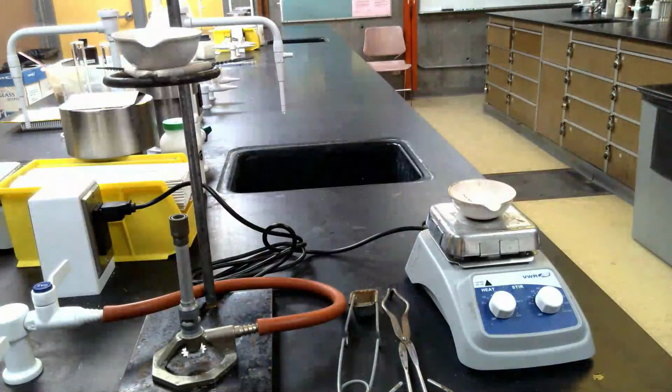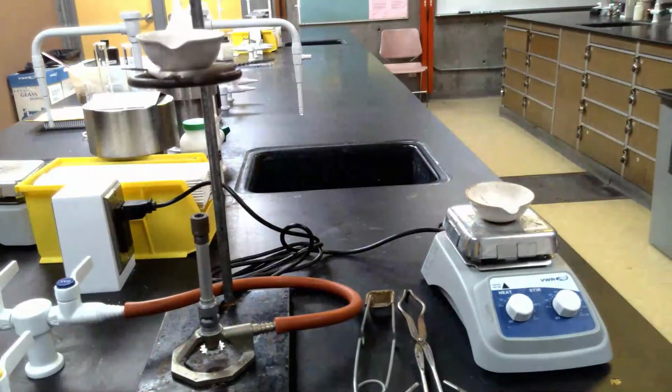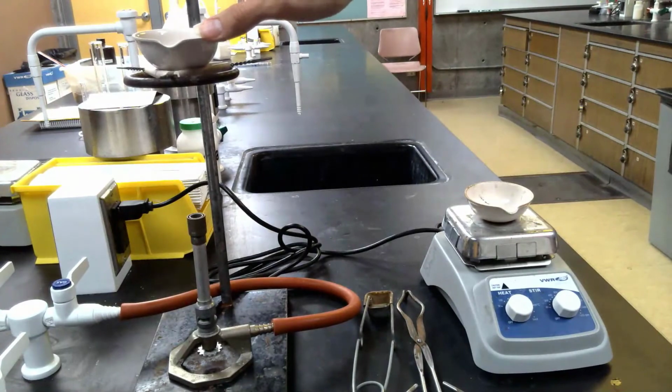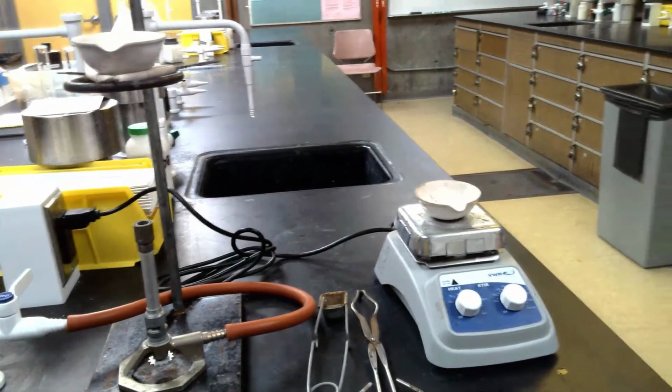I have everything set up here so that I can run both of the heatings to finish the experiment simultaneously, instead of doing everything one at a time. It just saves time that way. I have my salt water in an evaporating dish that I'm going to be heating with the Bunsen burner, just like I did during the first heating.